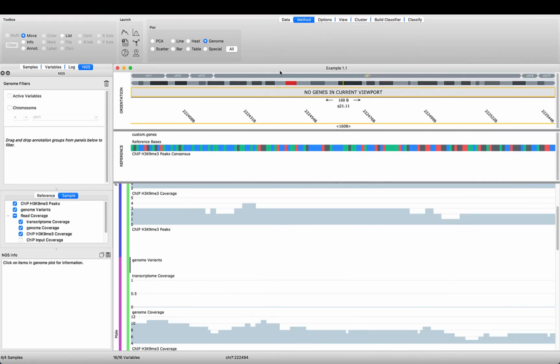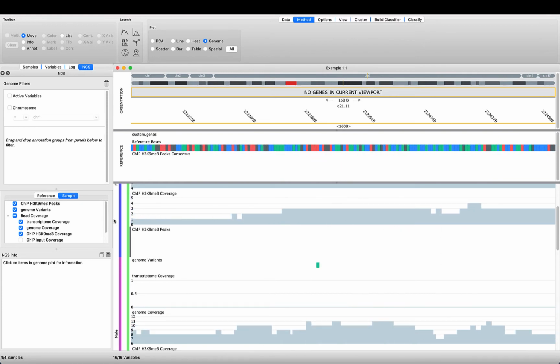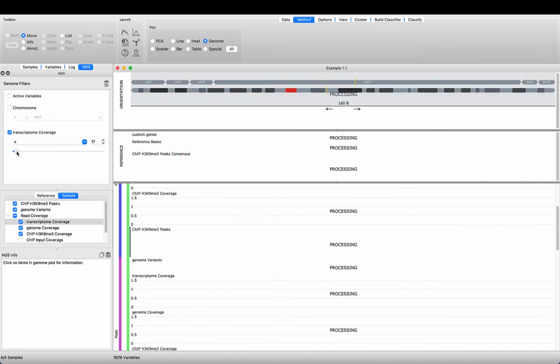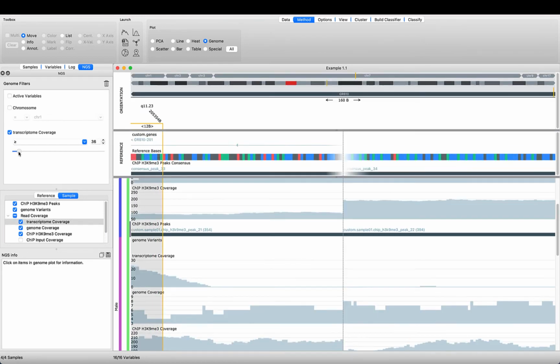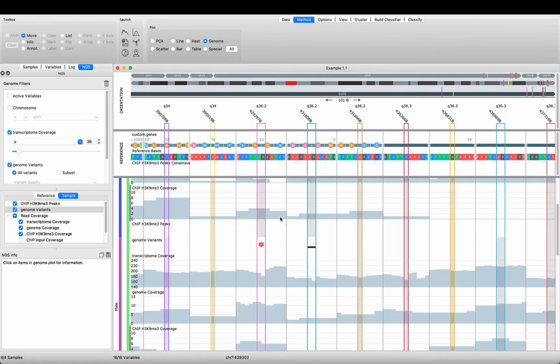It includes an interactive Genome Browser supporting advanced genomic analysis, including mutation analysis such as variant calling, and also detection and analysis of gene fusions for RNA-seq data. For variant analysis, you can choose to either run a variant calling algorithm while loading your data or upload your own VCF file to filter on variants.